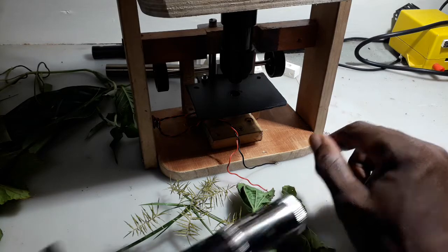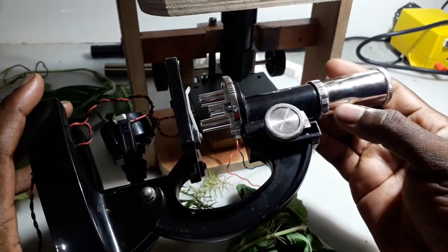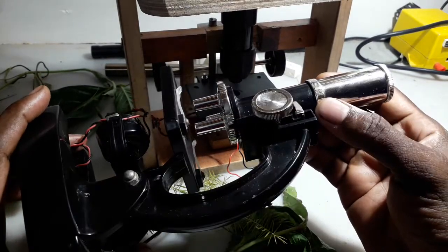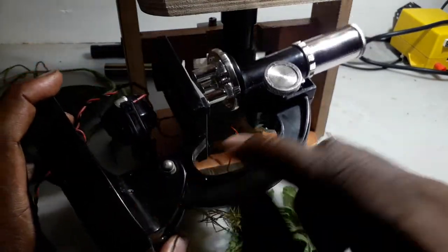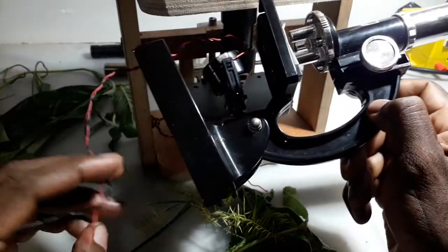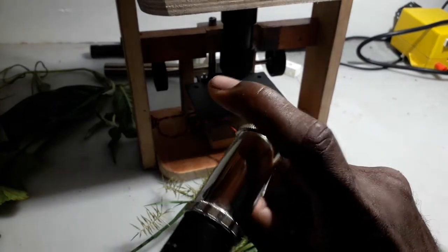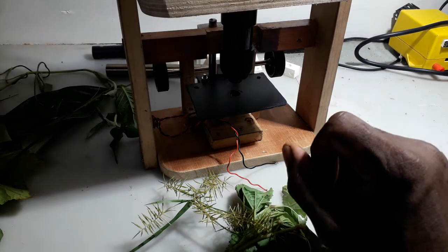Now I also have this stuff I had for a while. You can say these things are almost toys or something, but they do the job for starters. You can buy them on eBay or get them if someone is getting rid of them. This one I redid the wire, so I don't have to depend on the battery, two AA or AAA batteries. I can have a constant source of current for power supply. But I'd like to make a piece so I can get a camera on there so I can document certain things, take photos of things I got.